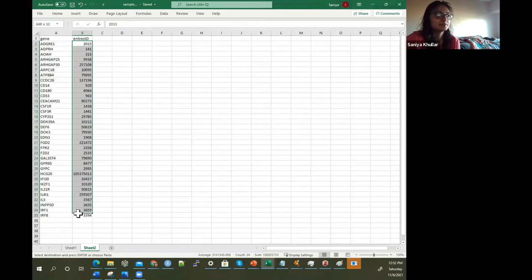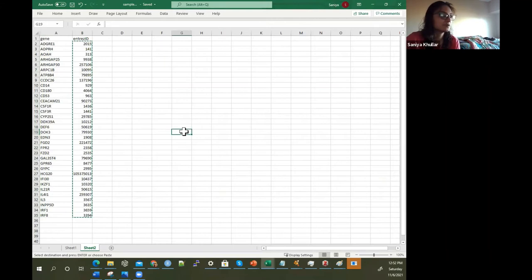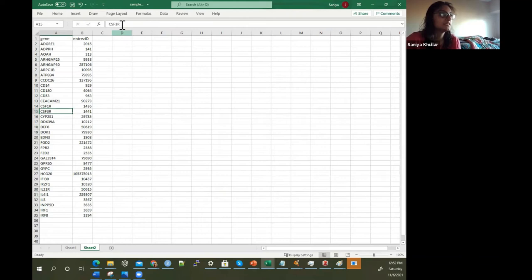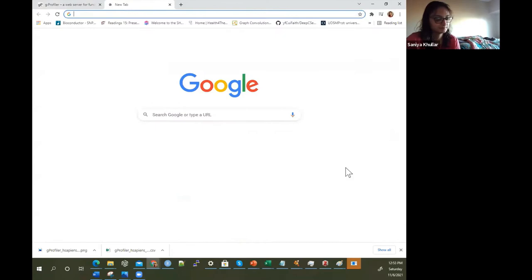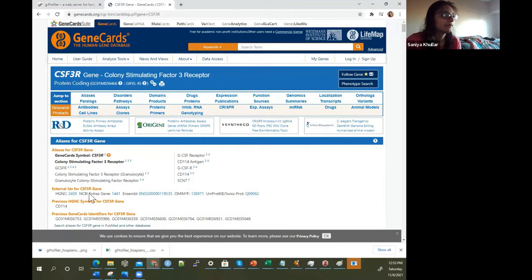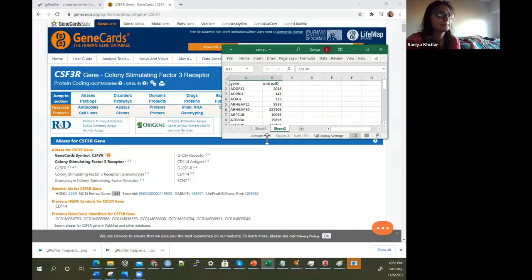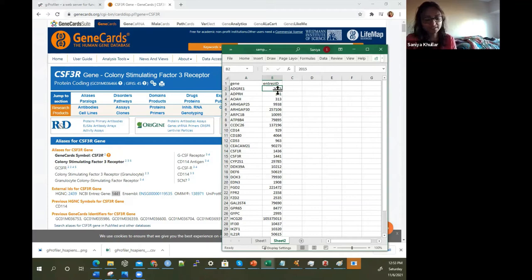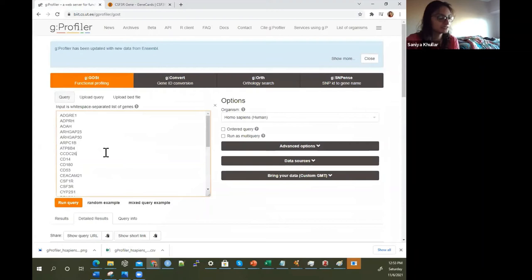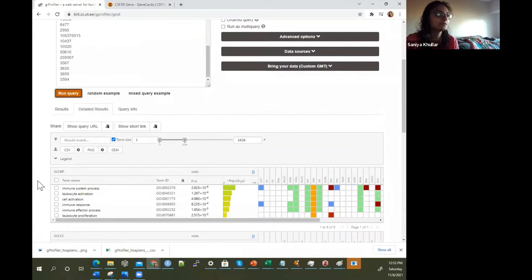We looked up gene names. Now I also want to show you what happens if you use Entrez IDs. These are the gene IDs for each of the corresponding genes. For instance, if we look up CSF3R, we find that its gene ID is 1441, which is exactly what I have in my mapping file. When I have the Entrez IDs for CSF3R, it's 1441 — exactly what this is over here.